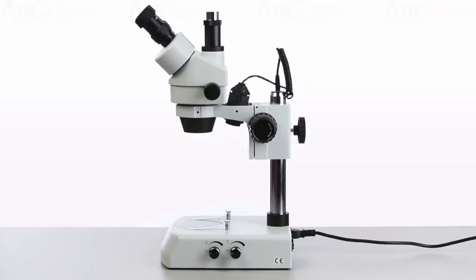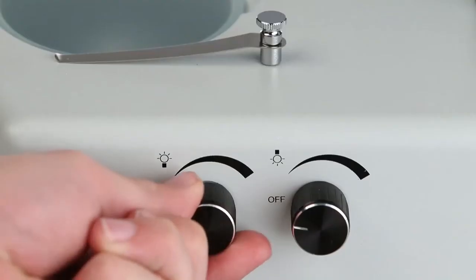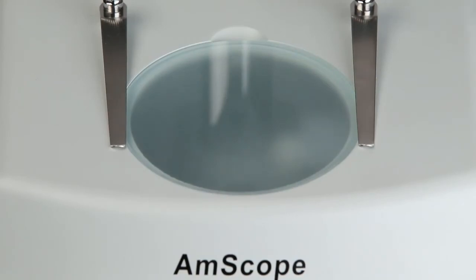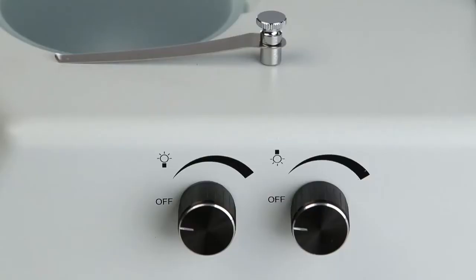The microscope has two switched dimmer knobs. The knob on the left controls the bottom lighting. The knob on the right controls the upper lighting.